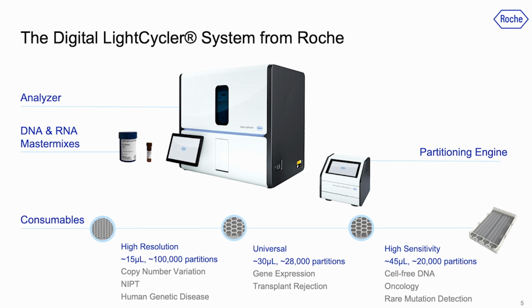As I mentioned, there's the consumable, which is this nanowell plate. Just to walk you through this, it is essentially a nanowell plate. In particular, you can see there is a barcode associated with the plate itself. There are 8 inlet ports here, so you can imagine a sample per lane. Each one is designated as a lane here, and then the output lane right here. So this is the anatomy of the consumable.